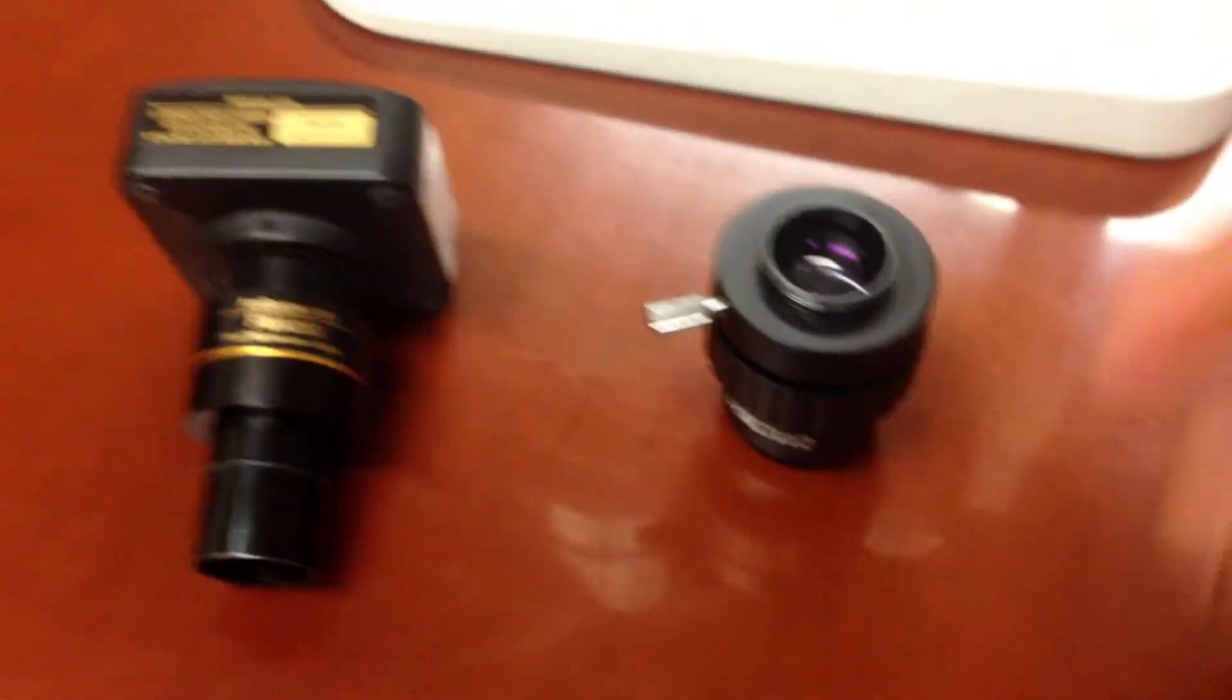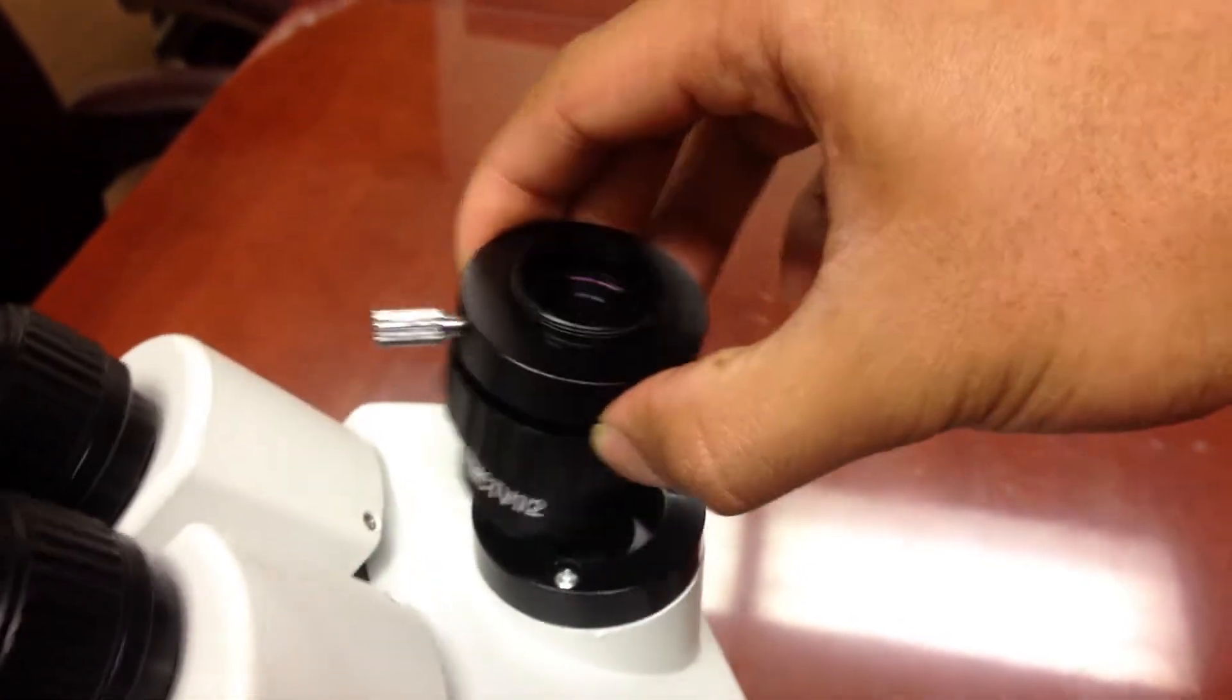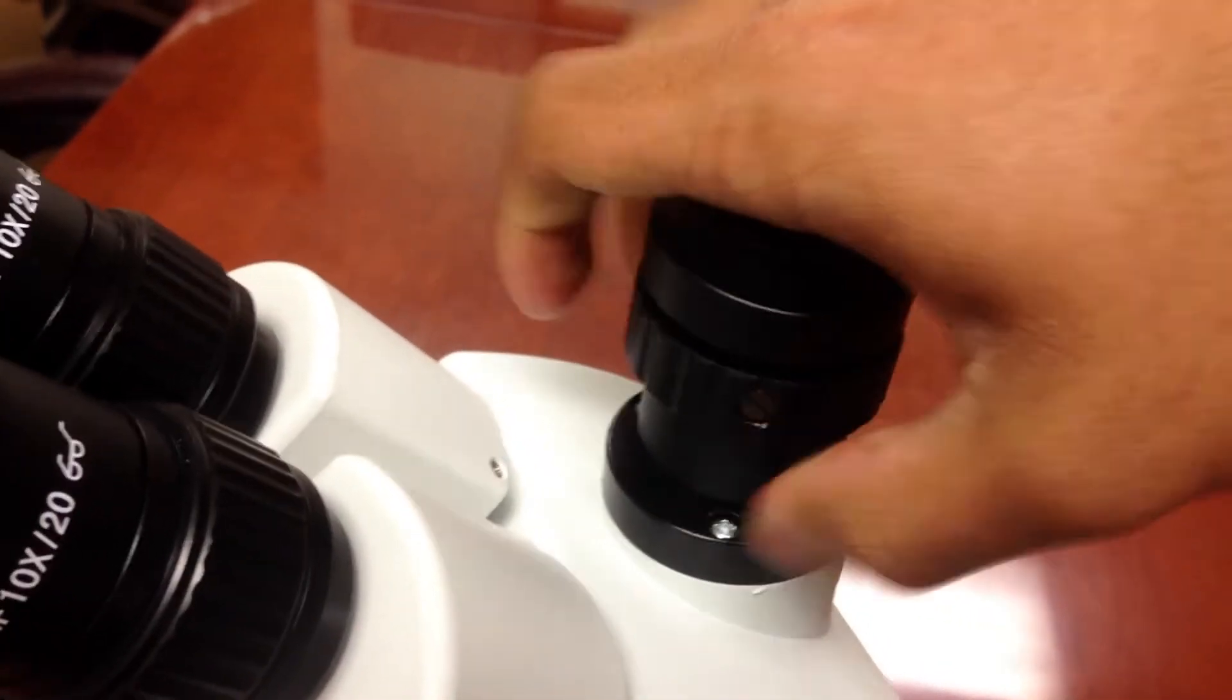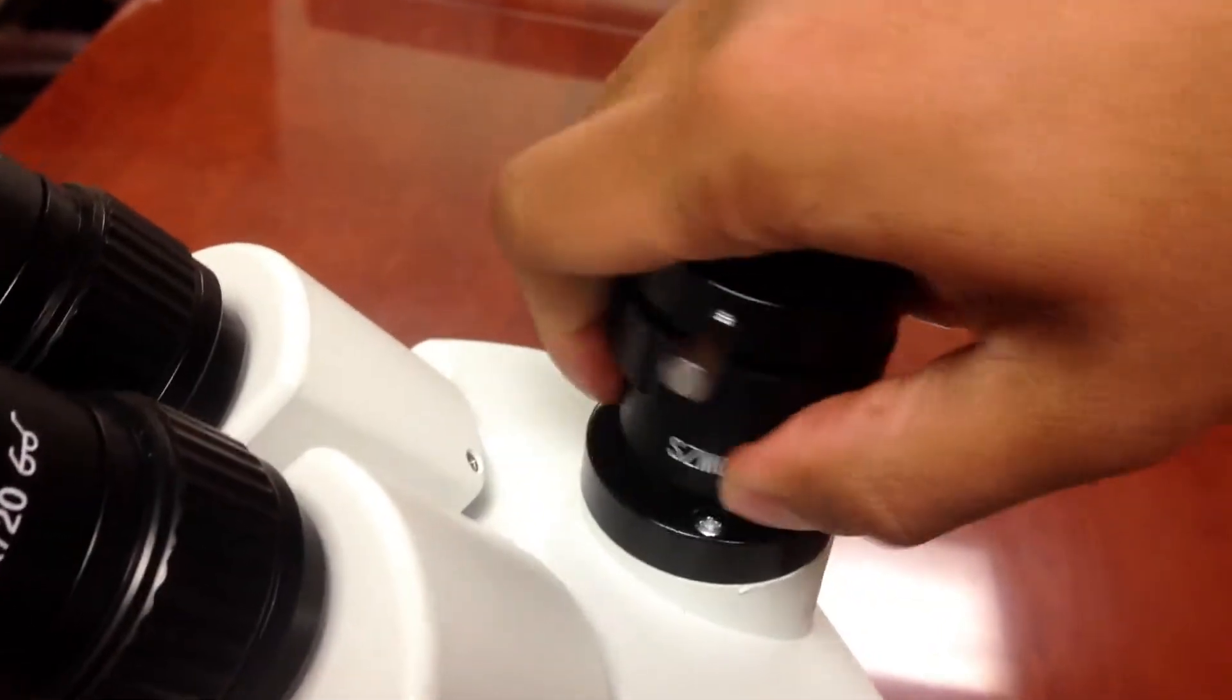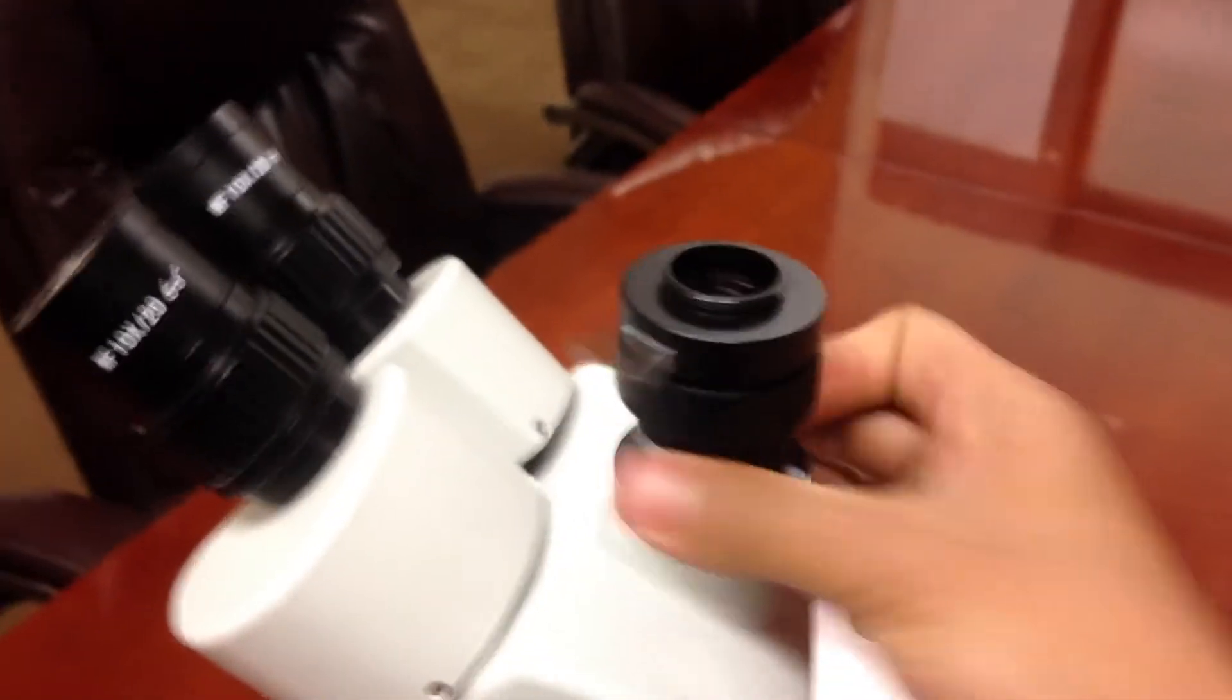And then you're going to go ahead and get the AD-C20 adapter. And as you can see, there are threads at the bottom and on the top. So what you're going to do is just screw this on. Sorry, it's kind of hard doing this with one hand. There you go. Screwing on.